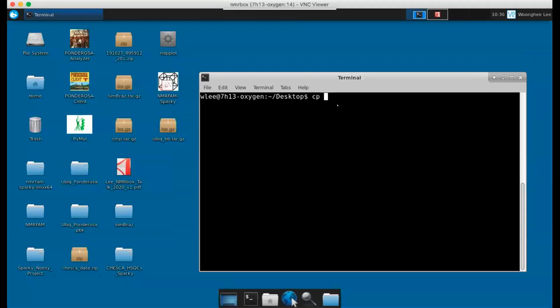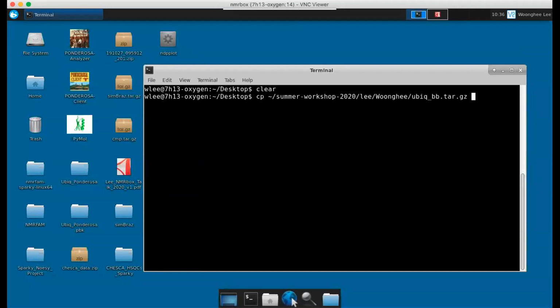I think Adam already copied the file into your home directory. Was that somewhere? Yes, that's correct. In everyone's home directory, inside that directory there, Woong-hee, I believe you put inside Lee presentations for everyone. Mm-hmm. So I'm just going to copy from my home directory, Summer Workshop 2020, Lee Woong-hee, the ubiquitin bb tar.gz to my desktop.